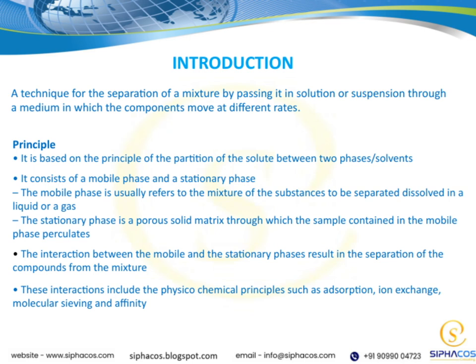These interactions are governed by various physico-chemical principles like adsorption, ion exchange, molecular sieving, and affinity. In essence, this technique involves passing a solution or suspension of a mixture through a medium. Because different components move at different rates depending on how they interact with the stationary phase, we can effectively separate complex mixtures. This principle underlies many of the powerful separation methods we use in analytical chemistry.